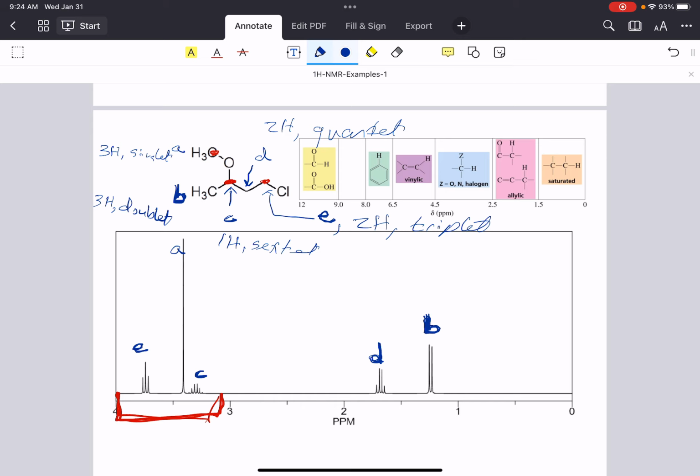So once again, we can use that combination of chemical shift, splitting pattern, and expected integration to assign these peaks. I think in these cases, really, chemical shift is secondary to the splitting pattern. Splitting pattern really tells you everything you need to know about these things, but we can use the chemical shift table to justify the relative position of each of those signals.